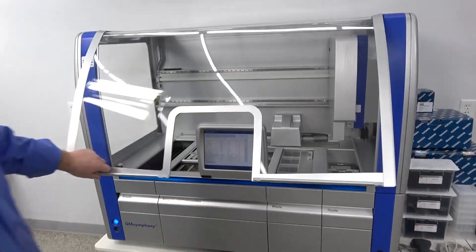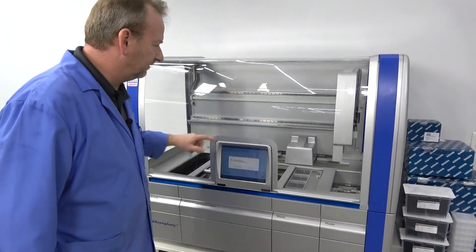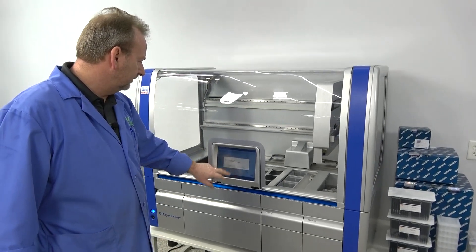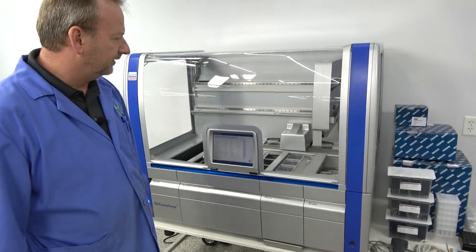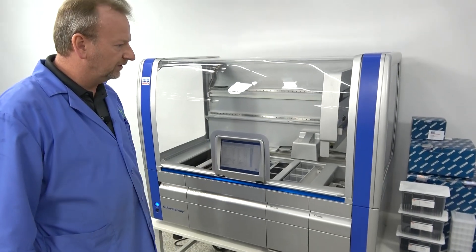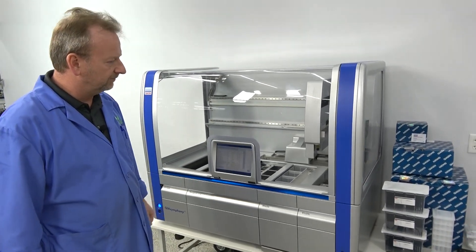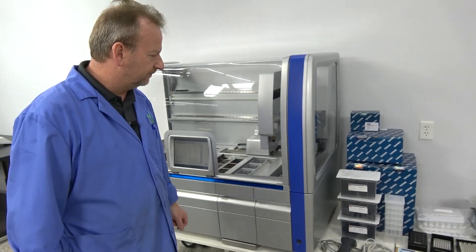We are familiar with these machines. Like I said, we had been into this one and fixed the board on it. We've dealt with these before. We actually have another one with even lower hours that we're going to be demoing here probably later.